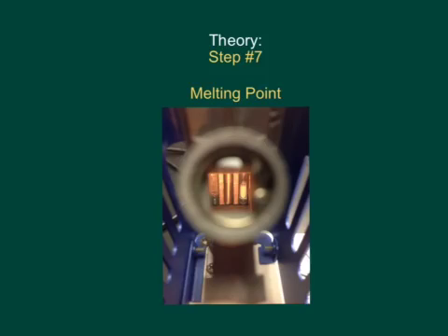So we close the other end so nothing can escape, and the caffeine will turn into a liquid form. This allows the student to check the actual melting point of their pure caffeine and to verify the temperature that it reached without it evaporating away.